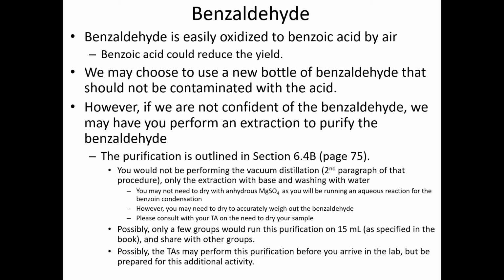Because of this, when this lab is performed, we might actually use a new bottle of benzaldehyde just so that we don't contaminate it with the acid. But hopefully the benzaldehyde that we purified in the very first lab wasn't exposed to any air and should still be pure benzaldehyde. If this is the case, then we can continue with this reagent. If you need to refresh on how we purified benzaldehyde, you can go back to section 6.4b, or go back to the original benzaldehyde purification video.